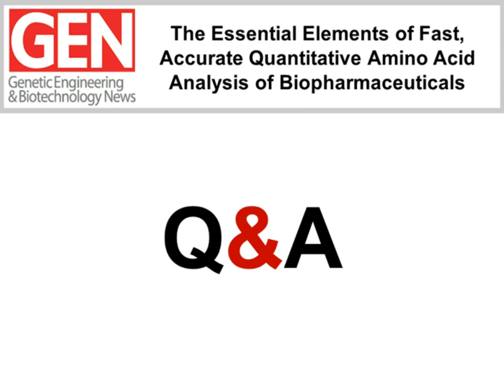We would also consider the possibility of getting the best analysis by splitting the sample into multiple parts. We would split the sample first to just do a plain hydrolysis and accept that in this sample there will be some variable level of destruction of the sulfur amino acids as well as complete loss of the tryptophan.